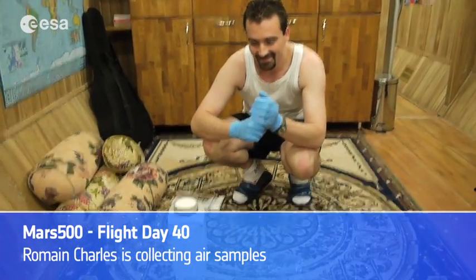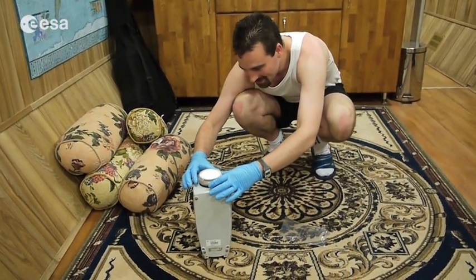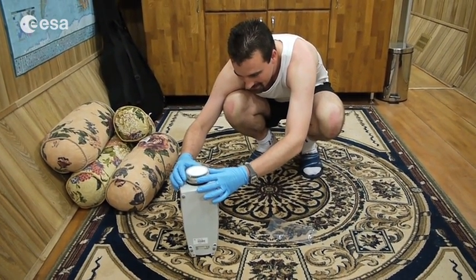Hi Roman, tell us what you're doing there in the middle of the living room. I'm just doing some air sampling on these gelatin filters.